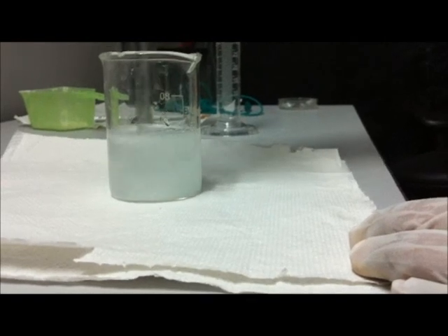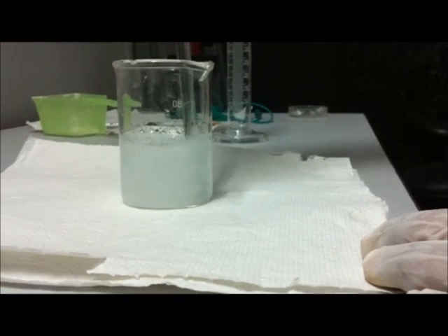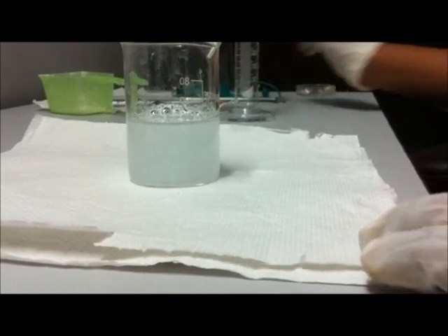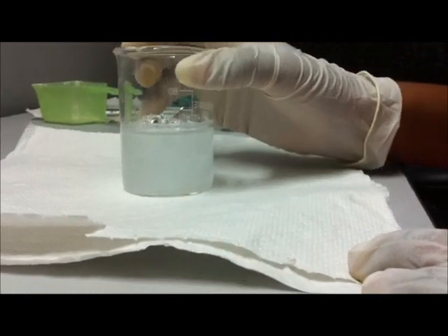Next we stir the mixture with the stirring rod or glass rod. You can also use a magnetic stirrer for the purpose. Now we've stirred it, setting the glass rod aside.